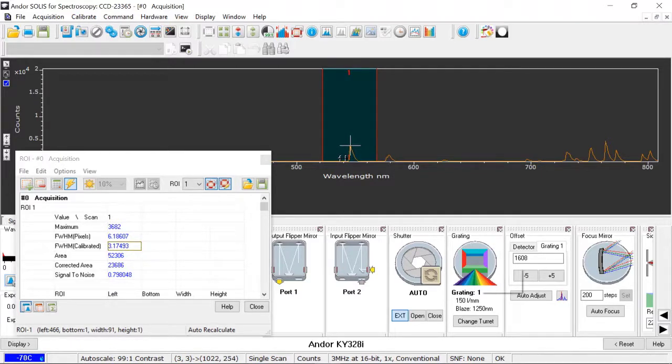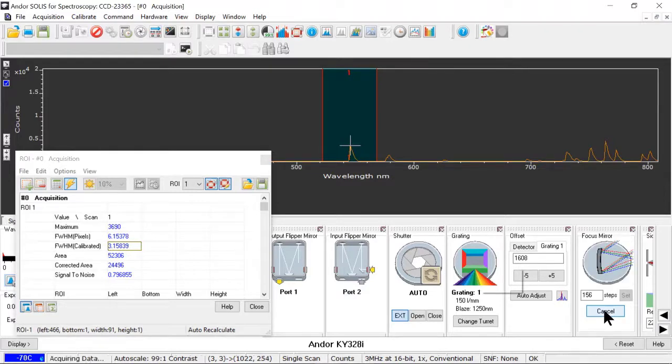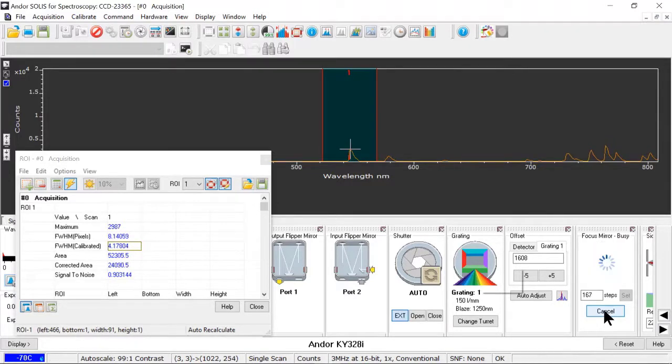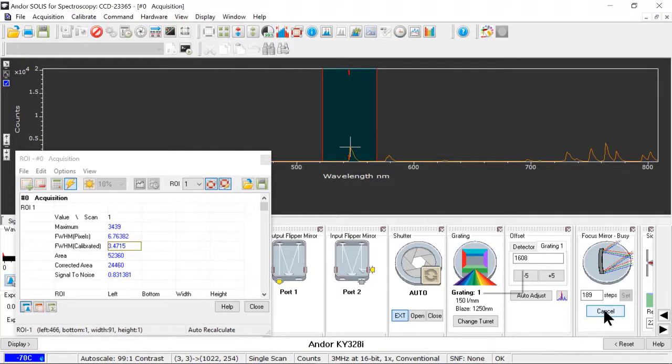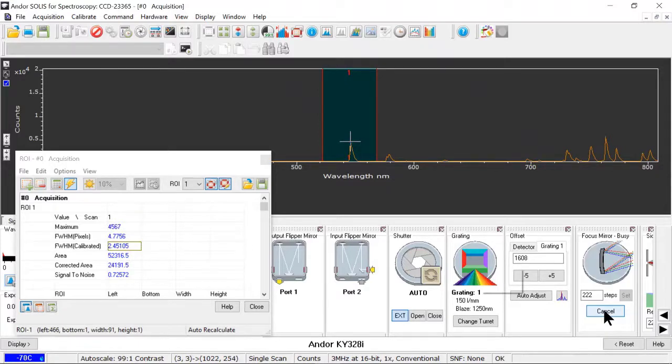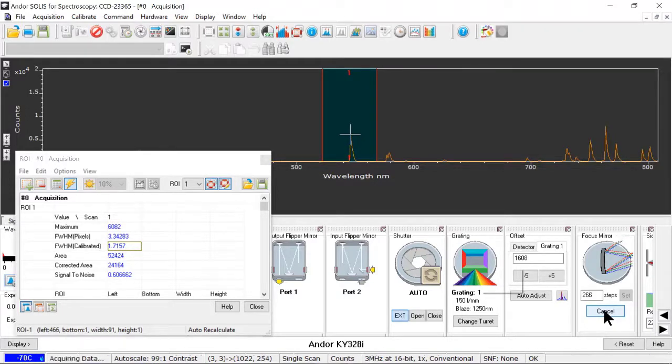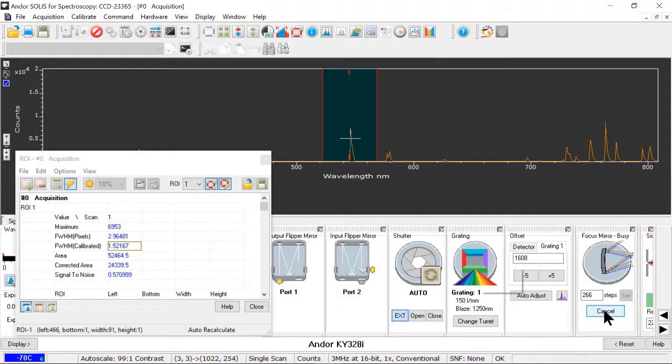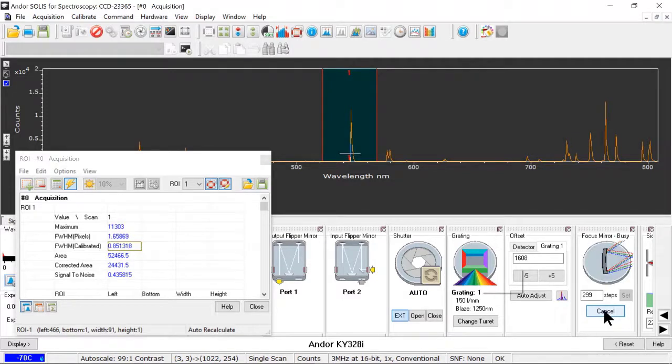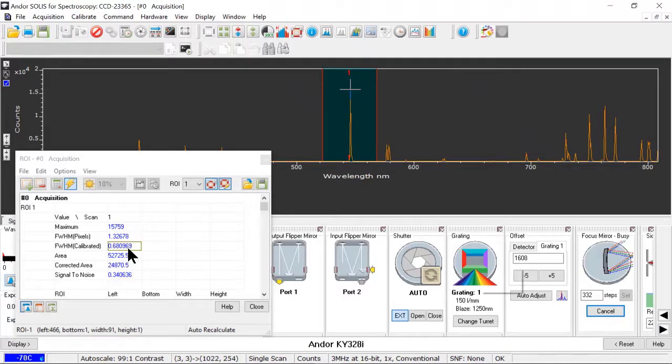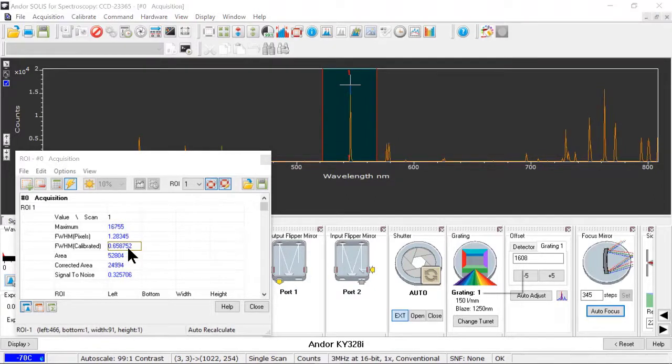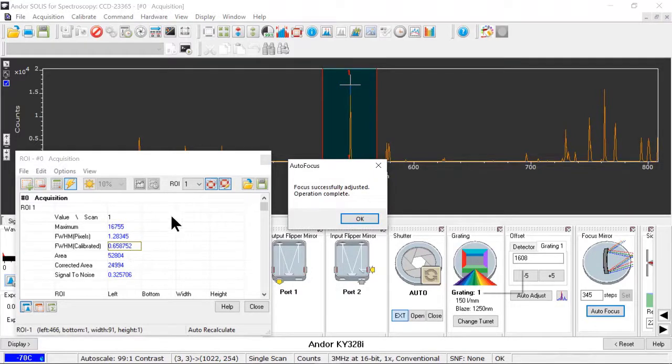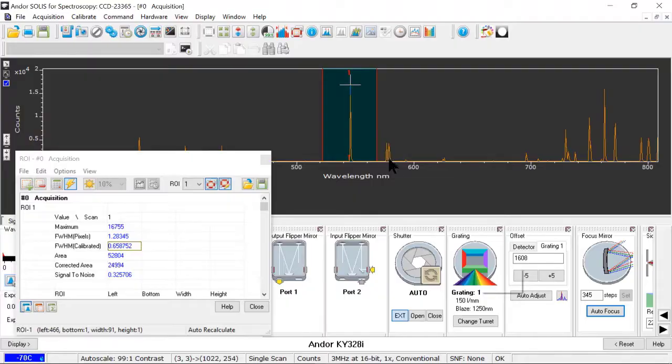And the question is, how can I automatically get that back on? If I just hit the autofocus button here, it might take a bit because I've moved it so far off of its optimum. The spectrometer, camera, and translation stage in there will work together to adjust my focus to give me the minimum full width half max, or the maximum spectral resolution. So using the feedback from the camera, it will find my best focus position. And you can see the full width half max changing as it adjusts. It will probably overshoot because it needs to find the minimum. So it'll go a little too far and then come back. But it's found a focus, guaranteeing me the best possible spectral resolution. And you can see out here it's restored the ability to separate these two lines in this doublet apart.